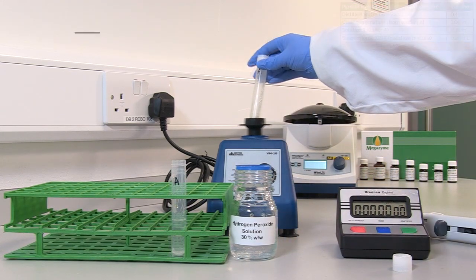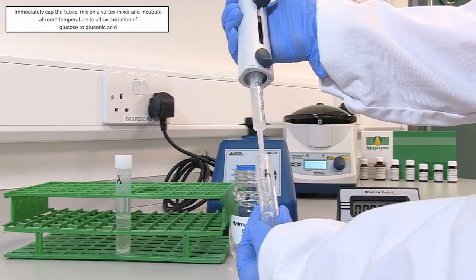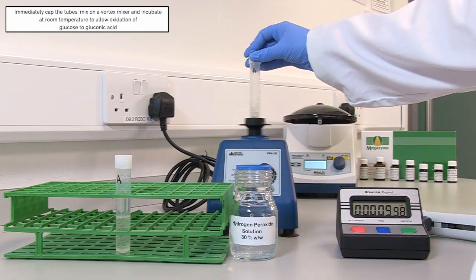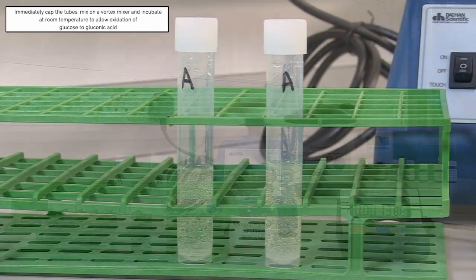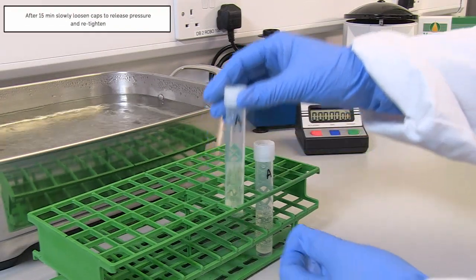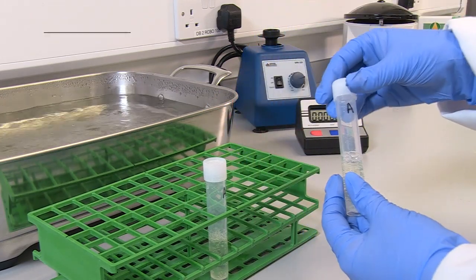Immediately cap the tubes. Mix the contents on a vortex mixer and incubate at room temperature for 15 minutes to allow oxidation of glucose to gluconic acid. After 15 minutes, slowly loosen the cap to release pressure and retighten.